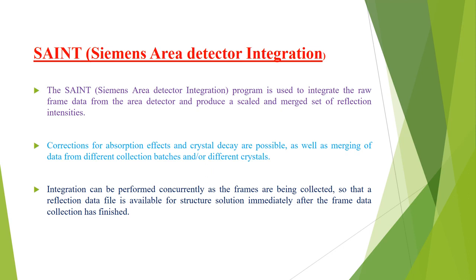The integration can be performed concurrently as the frames are being collected, so that the reflection data file is available for structure solution immediately after the frame data collection has finished. So this is another software program which is used in single crystal XRD, and it is used on the computers attached to the machines.